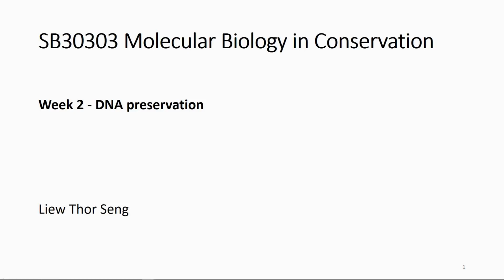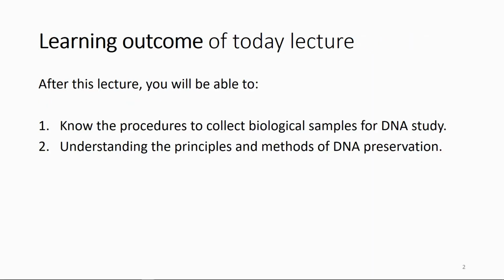So now we're going to start our course. First, we're going to discuss DNA preservation. Before we conduct any study, if you want to study the DNA, we need to collect the organism, and then we have to preserve the organism so that the DNA will be intact for further analysis.